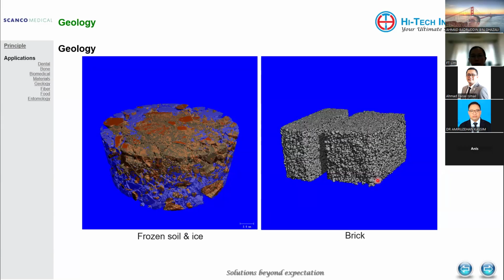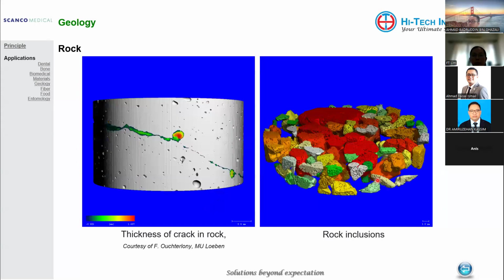So we actually get the material and then we do MicroCT scanning, and we come up with a report to tell how compact this is. And by using finite element, we do simulation of how strong this compound is after it has all mixed together for a construction purpose. Okay, so we can also look at the crack, study the crack without destroying the rock.